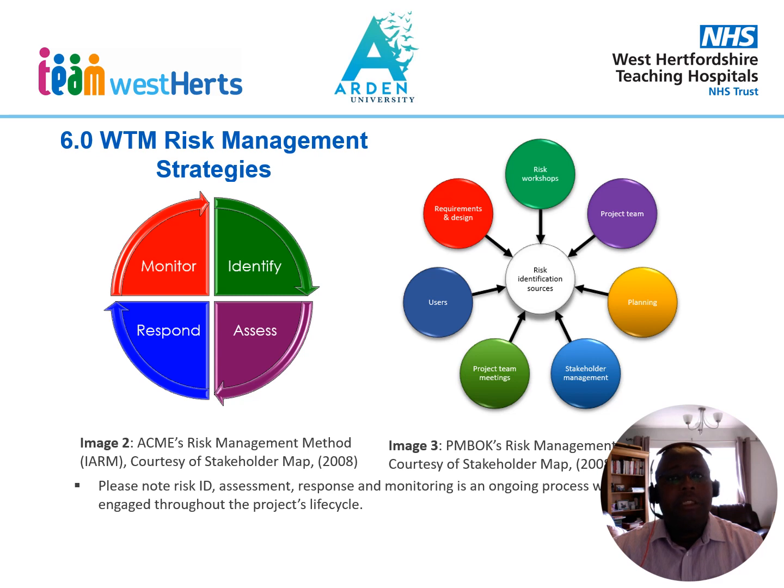With any project, risk is inherent. So I did the risk assessment, or we did with my manager. We did a risk management assessment using the identify, assess, respond, and monitor strategy, which is given by the risk management methodology. And then the interaction with the prospective project team, the planning, and interaction with users also helped us to identify other risks.